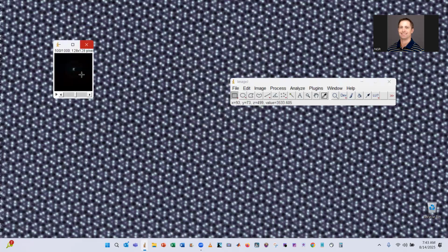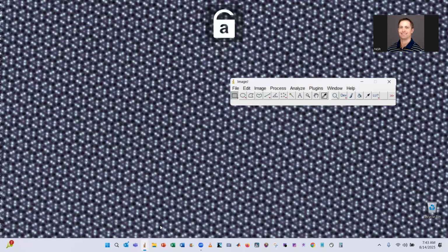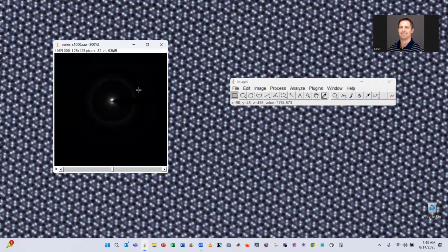Okay, so here I'm holding down Control and then scrolling with the mouse wheel.